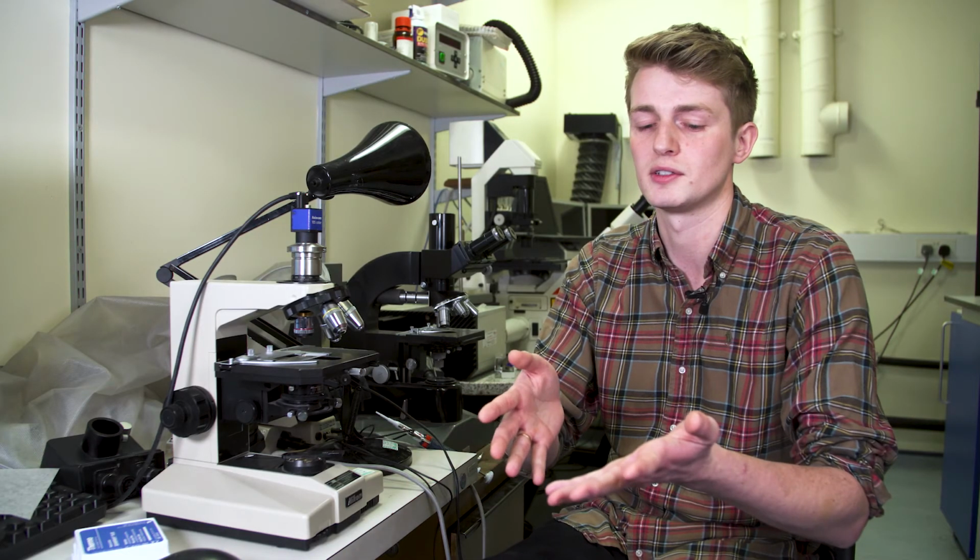What we're doing with those samples is studying both their composition, so any traces that they may have, but we're also observing how they crystallize and what ferns they create. It's quite cool that we get to see differences in ferning patterns across the globe, to see if there's any variation. It's going to be important to understand what is actually happening as well as just observing it. And we hope that X-ray crystallography will be able to contribute to that and tell us exactly what the composition of these ferns is.